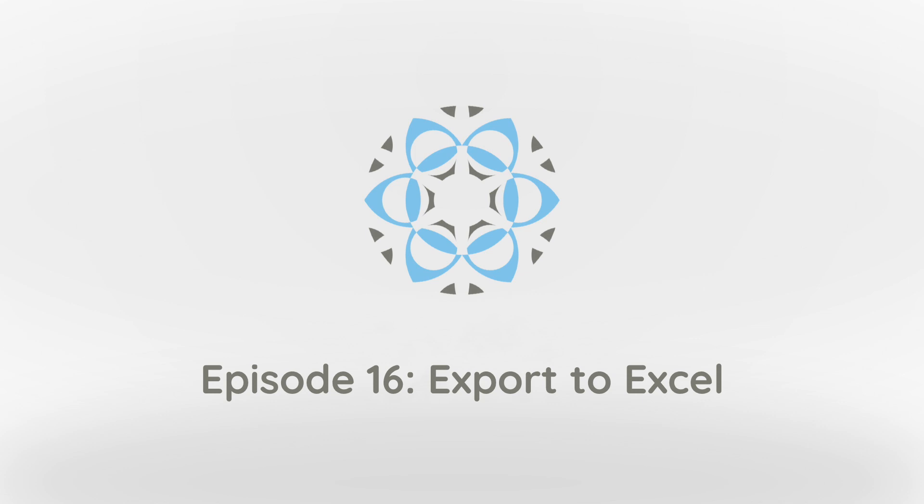Of course we could export results to spreadsheets before, but with the new export feature we can write results to specific cells in an Excel table. Let me show you an example.